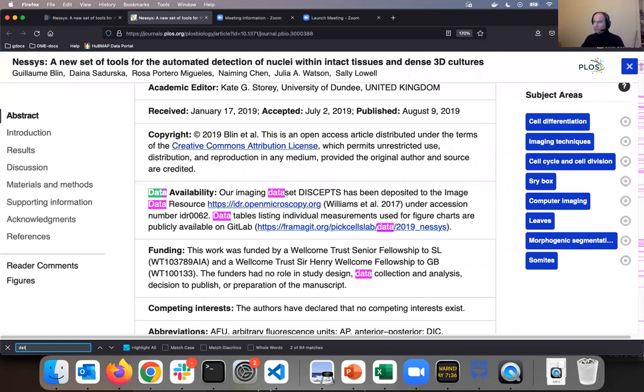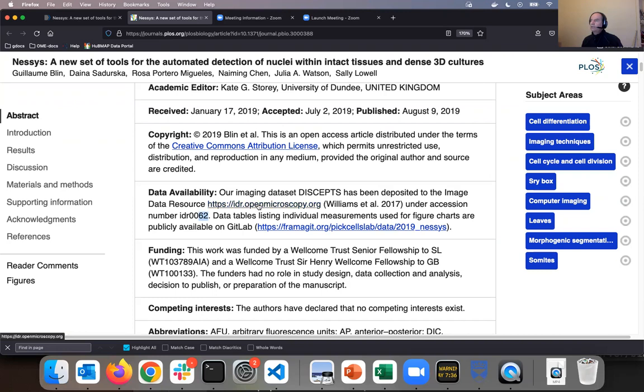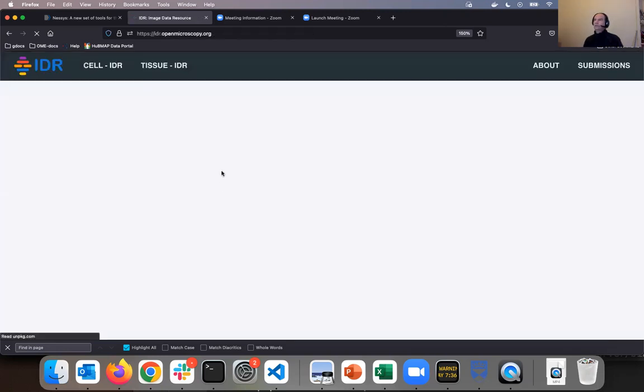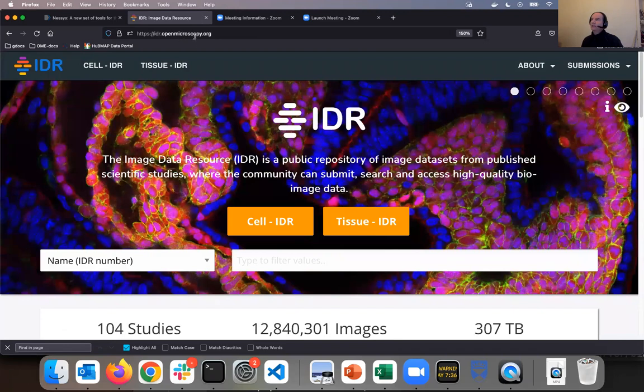I will start searching inside the paper for data availability section. This is found in this paragraph, and indeed claims that the data has been deposited to the image data resource, IDR, under accession number 62. I will click on the IDR link, and I'm landing in the homepage of IDR.